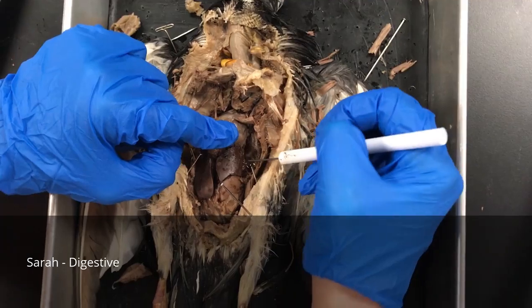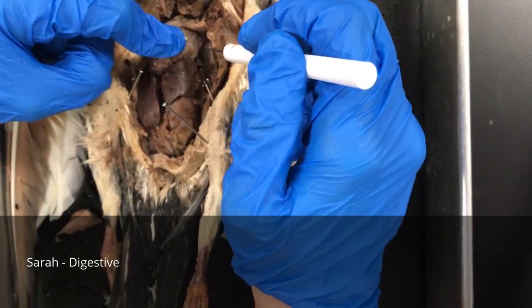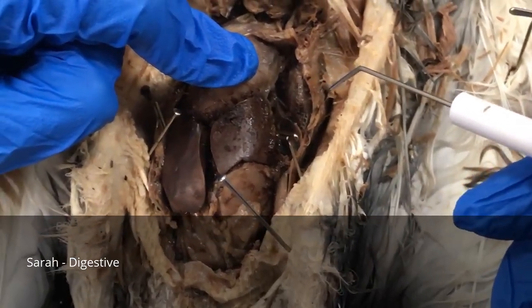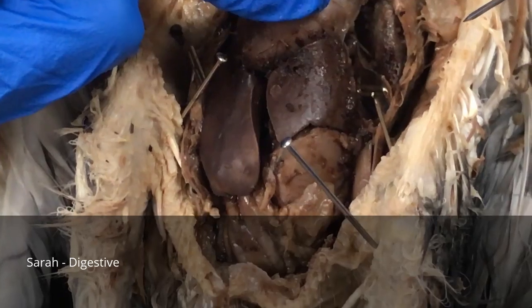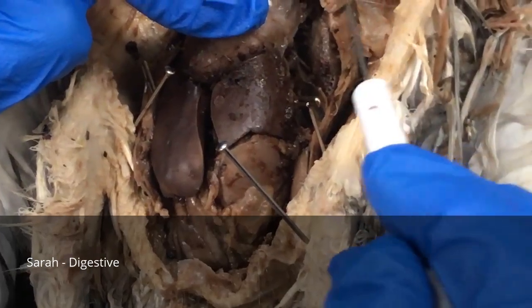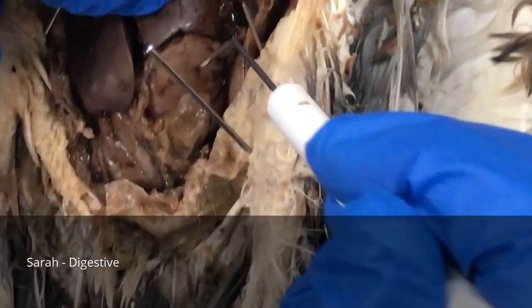It's down here, you can't really see it, it's probably behind the heart a little bit. When it's in the proventriculus, which is the stomach, there is a release of hydrochloric acid, and it disrupts the extracellular matrix that binds cells together in food material like the seeds or the corn. And that's for chemical digestion in the proventriculus. And once it goes through the proventriculus, it goes through the gizzard.